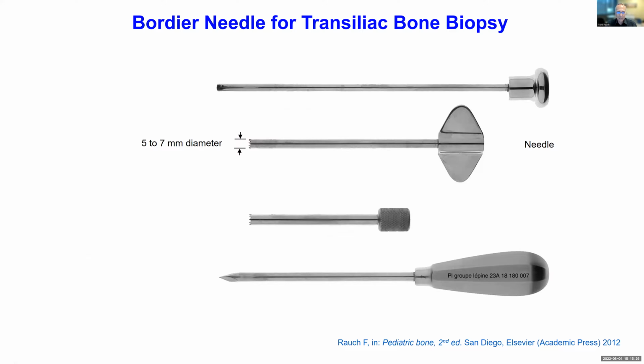Like in anything that we measure in science, you need a certain amount of observations in this space, trabecula or osteoblasts, to not have too much variability in your results. So you need a certain amount of tissue to have a good histomorphometric analysis.